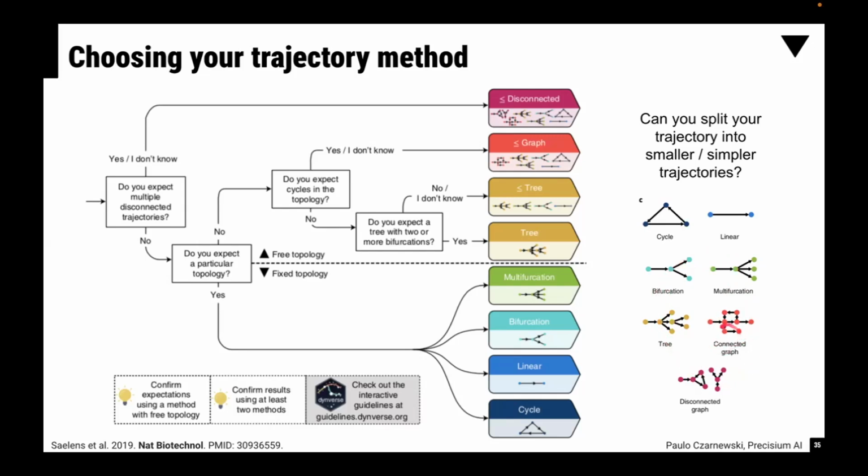Unless you have a cyclic pattern, but I haven't seen that yet, where you have Th17, then a state, then another one that is maybe Th1, and then another state. I have never seen these cycles in T-cell plasticity. Usually it's just a direct link between them.